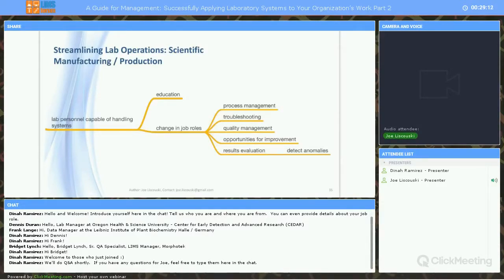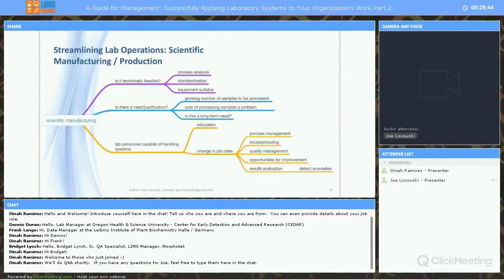In many instrument data system combinations, the scientists or lab technician may not see the actual instrument data output, but rather relies on the printed report. That can be a problem because the report is a result of a filtered analysis process and may overlook contaminants or things that just might not look right to an analyst looking at the instrument data. If we're going to embark on programs like this, the automated analysis is going to have to be rigorously designed to look for problems and flag them.